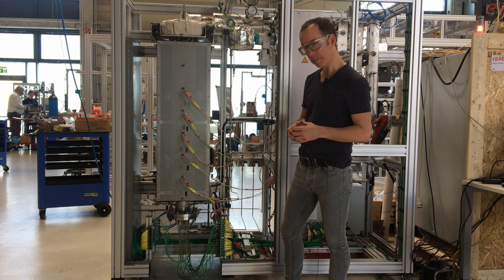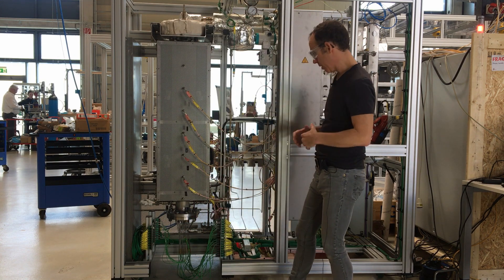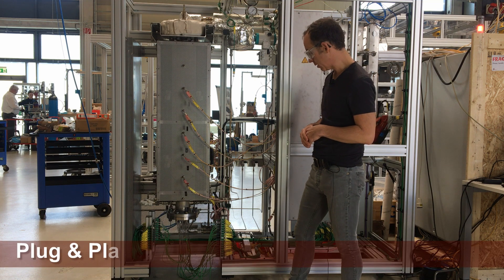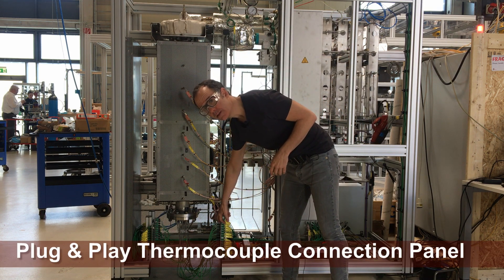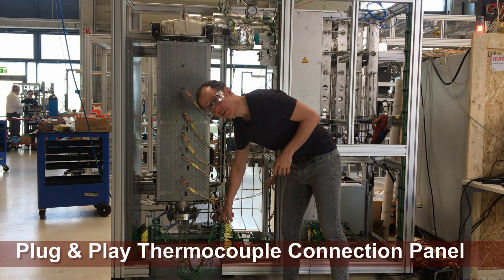You get an idea of how many points there are if you just look at the number of cables coming out of the bottom of this flange here. One of the challenges was coming up with a way of being able to insert and remove the cables easily. As you see here, we have a system with a plate where all of the connectors are easily inserted and removed.